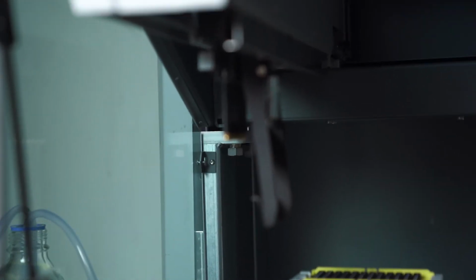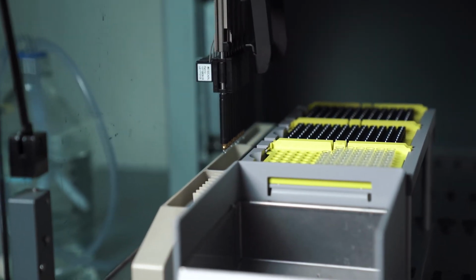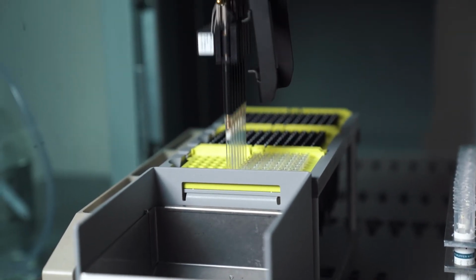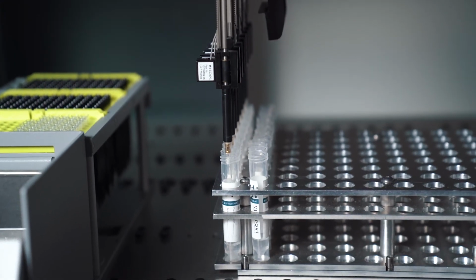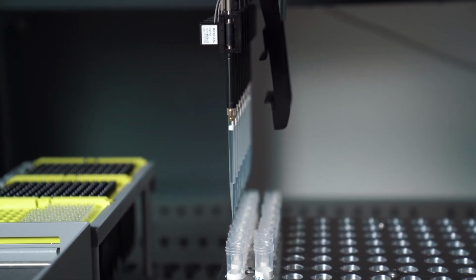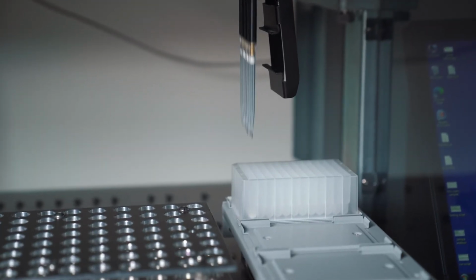All right, so now the moment of truth, let's do this. All right, so now it's washing. It's gonna grab the tips. All right. It's got the liquid. And it's gonna dispense. Success.